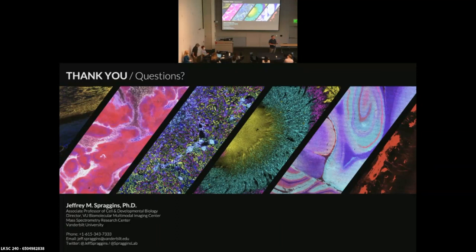For proteins, it can be a little bit tricky. So I didn't get into it today, but for proteins, we are limited in mass range. So with MALDI, we're generally dealing with low charge states, which for all the mass spectrometrists in the room, we can appreciate this, but it's really hard to move a very large ion with very few charges through a mass spectrometer. So we tend to be limited to sub 60 kilodalton proteins. So we're limited to smaller proteins, and then the identification of those proteins can be tricky in some cases.